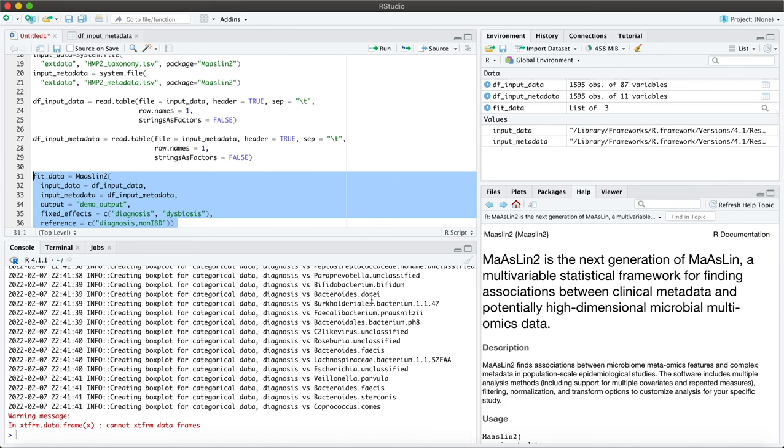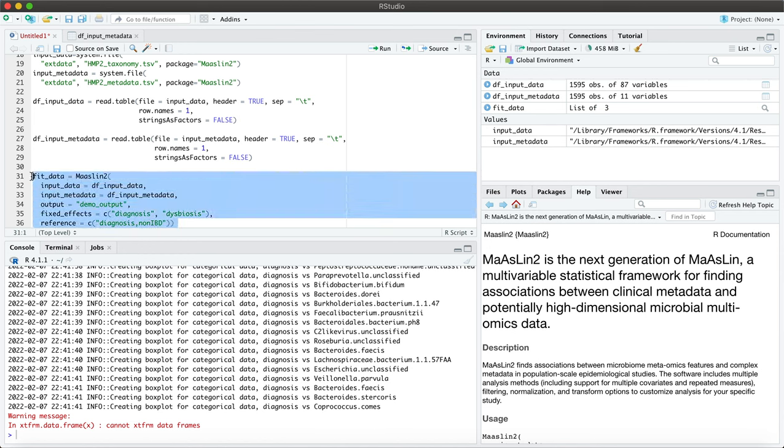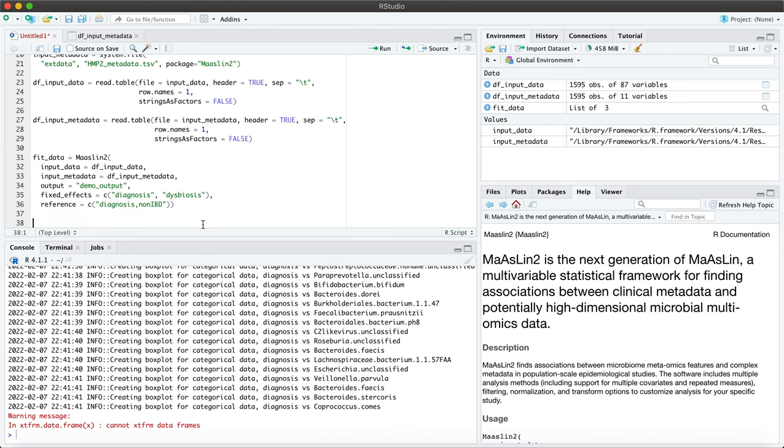Okay so it looks like it's done. Before we go ahead and review the output files, I want to show you a few things that you can do beyond the tutorial.